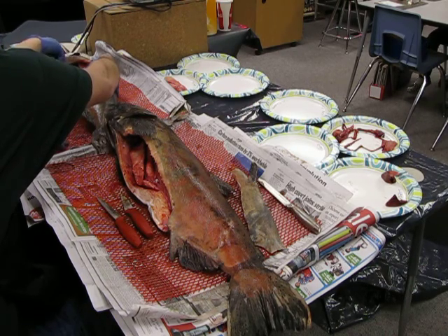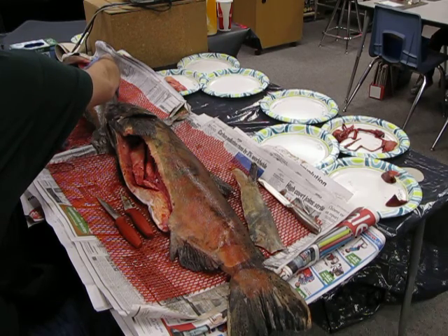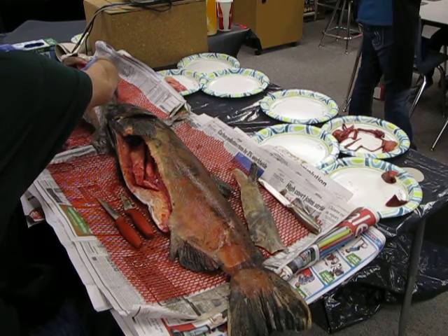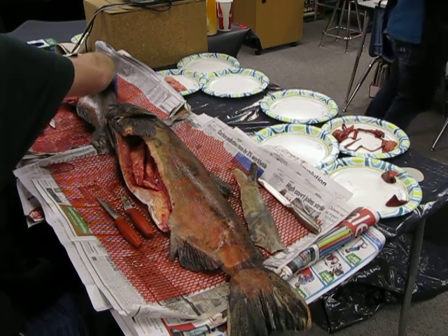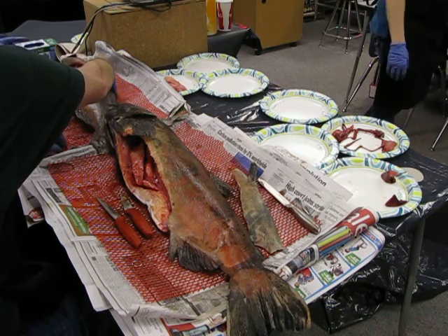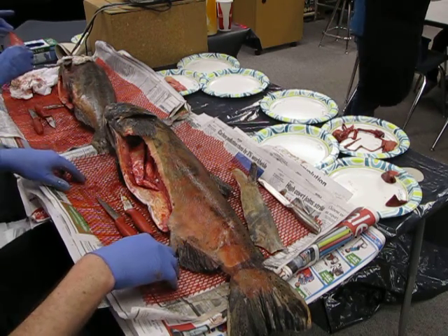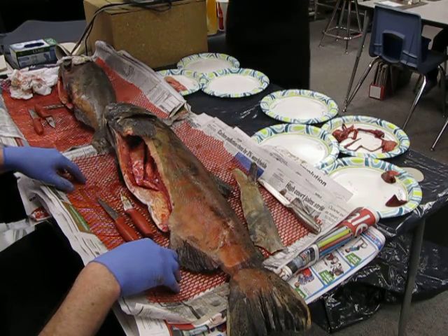It's kind of like a big balloon inside of them. It's full of a gas. It's full of air, basically. And it's deep inside the salmon's body. And it helps them float. Now, when you and I think of floating, we're thinking, oh, we want to stay above the water. We don't want to be underneath it, right? But for salmon, floating just means they don't want to sink to the bottom of the ocean or the river or the stream that they're in. They want to be able to move up and down, just like you're telling me, in the water. Swim bladder. Stick it on this plate with the other ones.